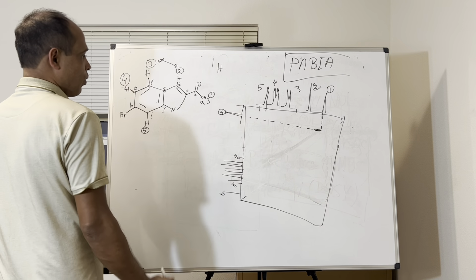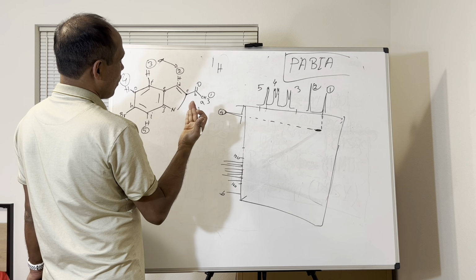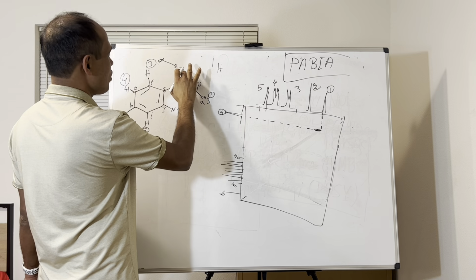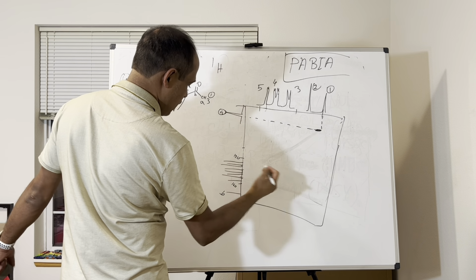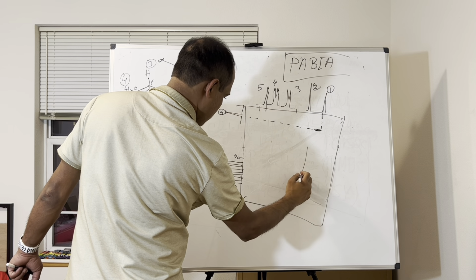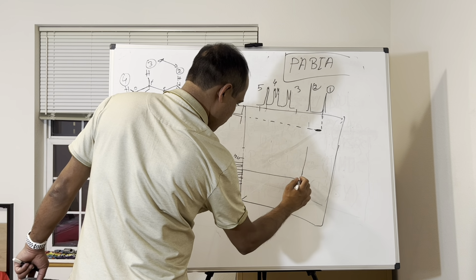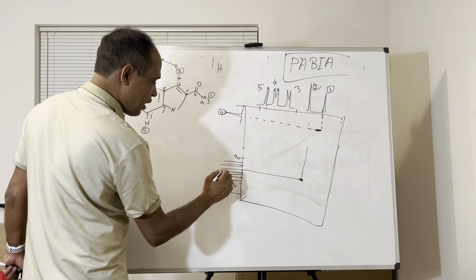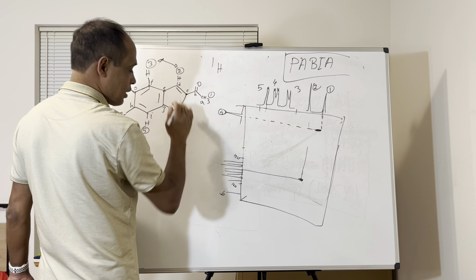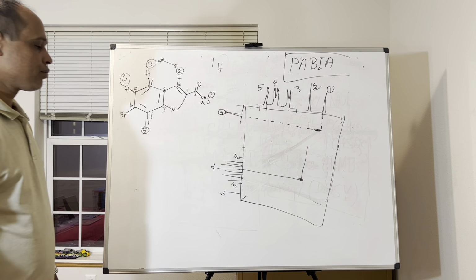Similarly, B doesn't have any proton, so you will not see any correlation here anywhere. Now D will have a proton, right? So which one is the D proton? The number 2. So if you see a peak here like this, you can easily say, okay, this number 2 proton is connected with D, so this carbon is actually the D carbon.